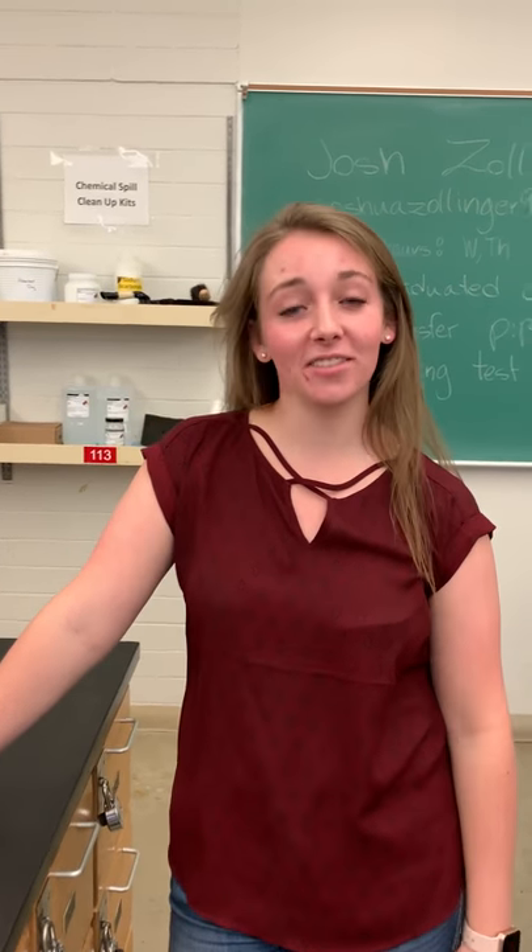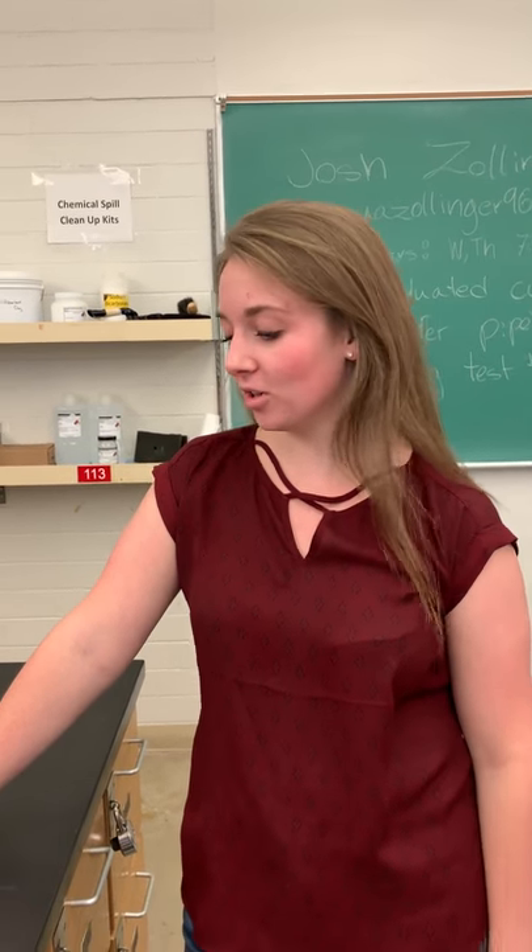Hi, my name is Justice Falls and I'm in Section 7 and Josh is my TA. I'm going to be showing you how to measure using a graduated cylinder.